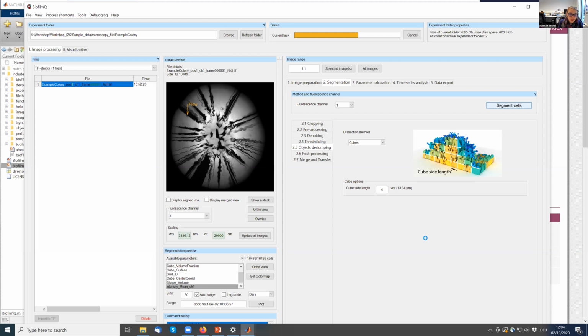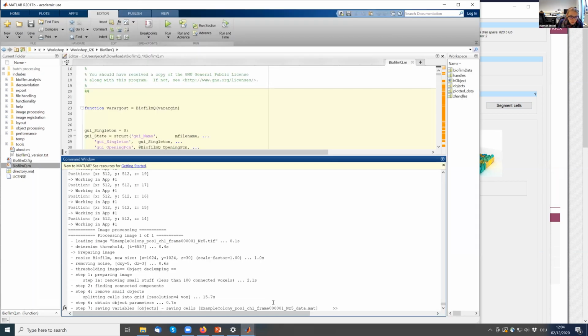And this is a little bit the downside of having a smaller cube size. You can already see it takes longer. We need to wait for it a little bit longer. Let's have a look at the console. We will soon be informed how much longer it took. I think we had 14 seconds before.